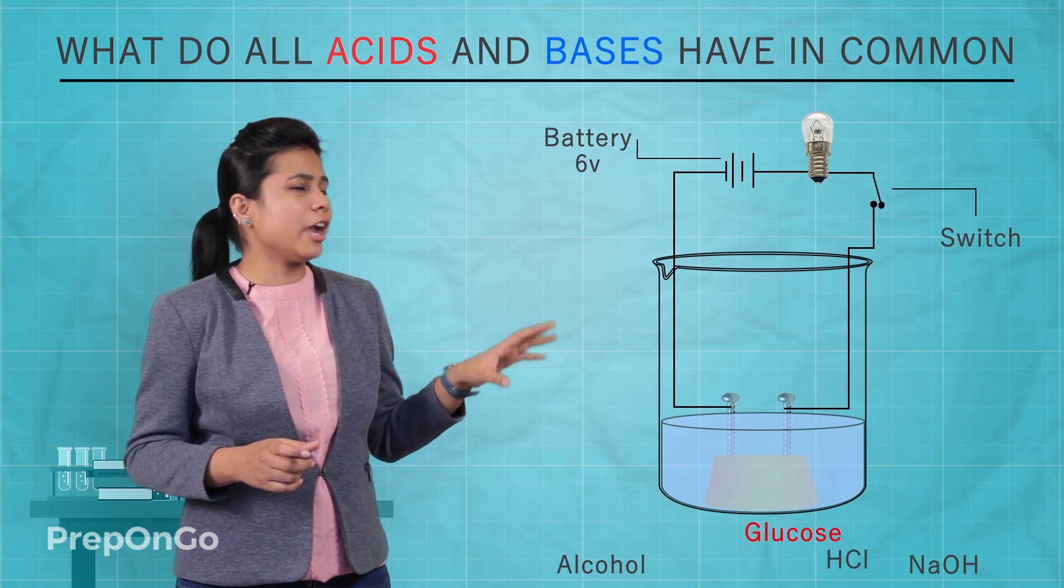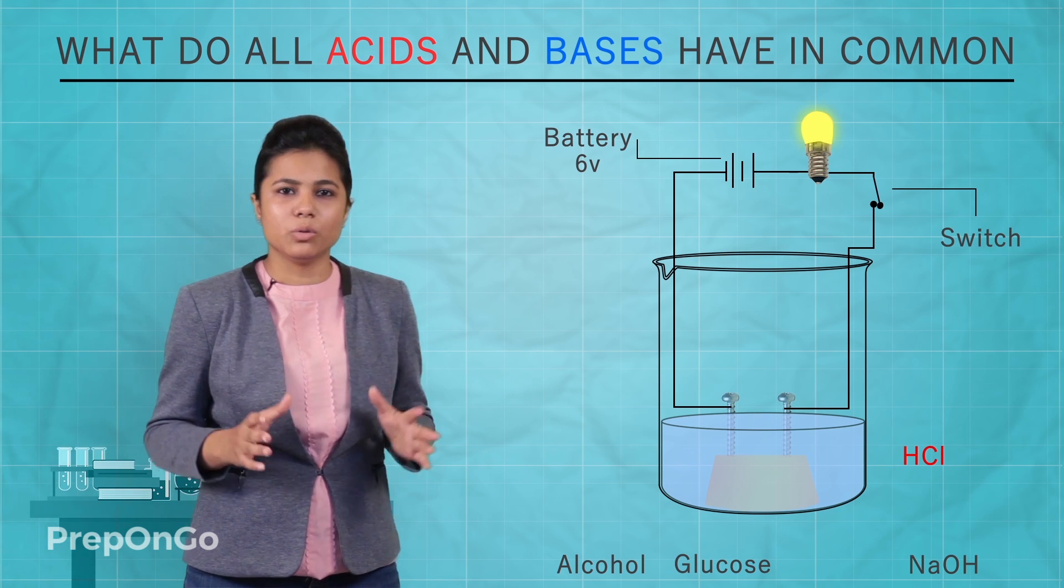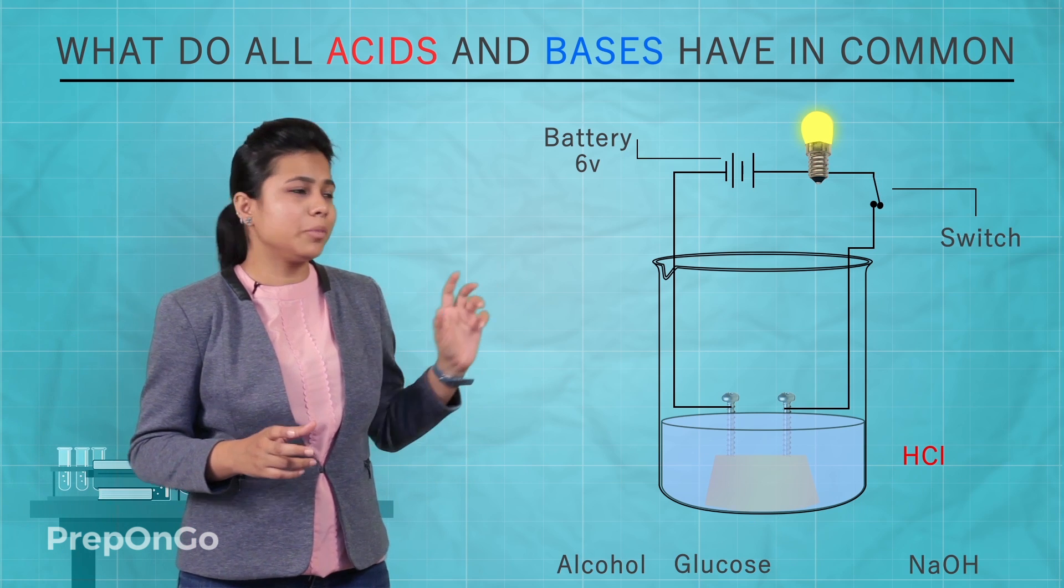Now let's put hydrochloric acid into the beaker. Bingo! It conducted electricity because the bulb is glowing.